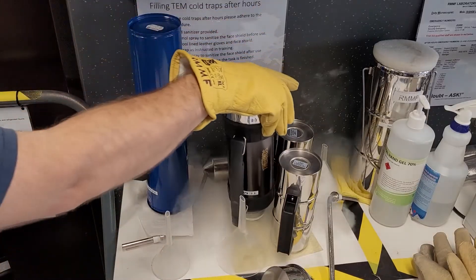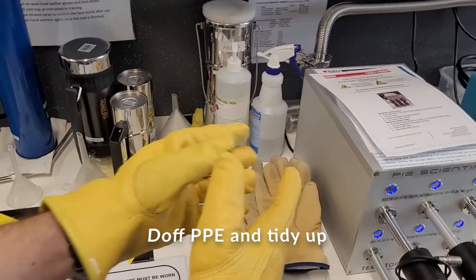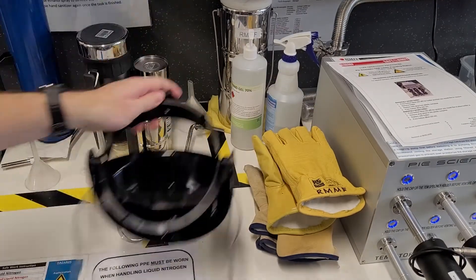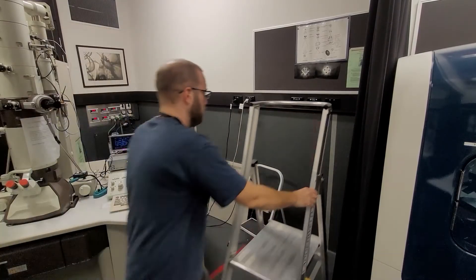Put the flask back upside down on the cloth. Replace the PPE and return the ladder to its storage position.